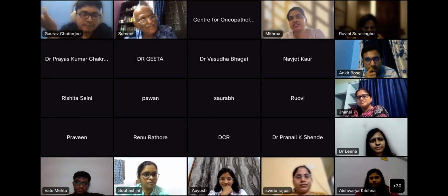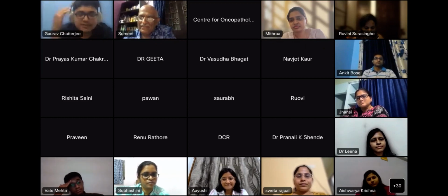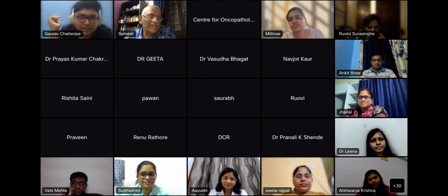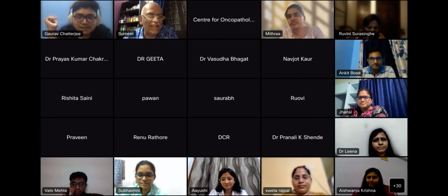Yes, and then we can talk to the histopathologist about what he is saying. Many times we call sir and say, this is what we are getting, and sir will again get back, this is what we are getting. So we can reach a final diagnosis. So yes, it definitely helps in that regard. Like Kunal showed you a case of AITL with a follicular pattern.